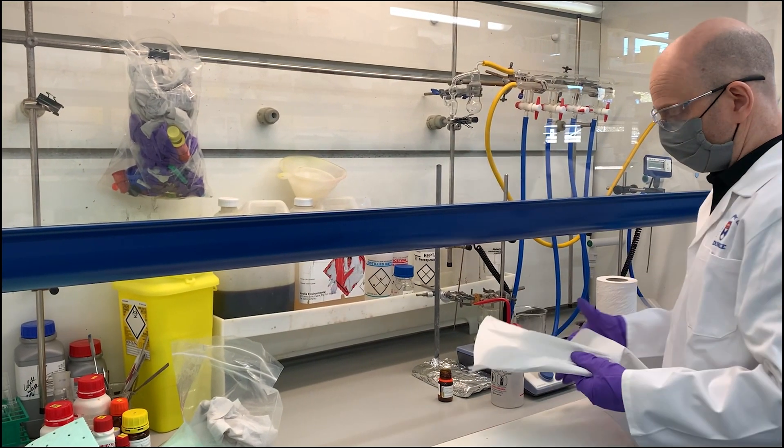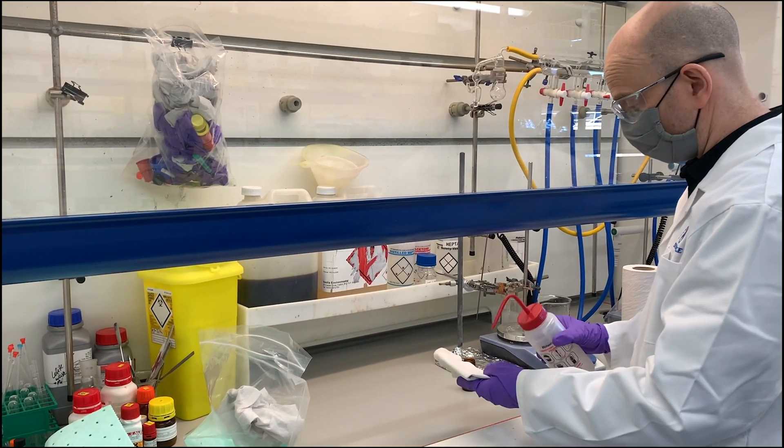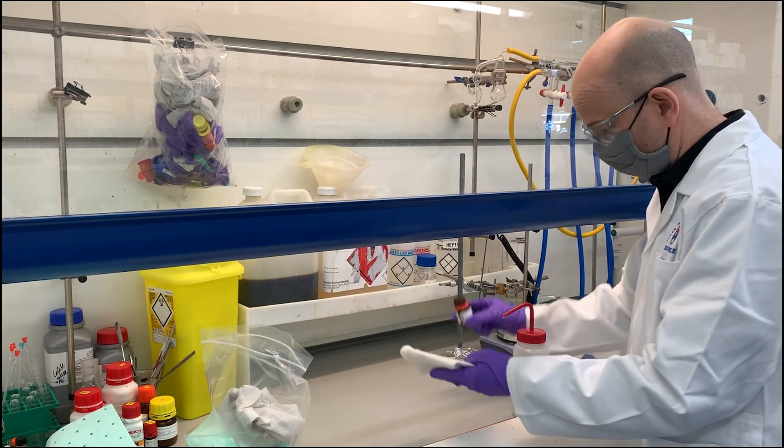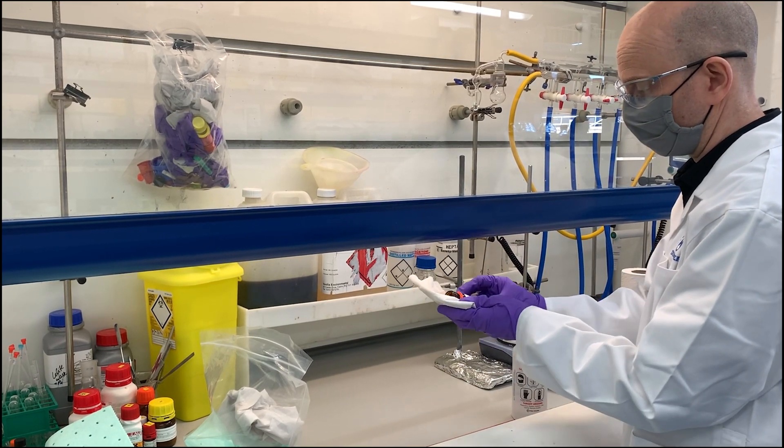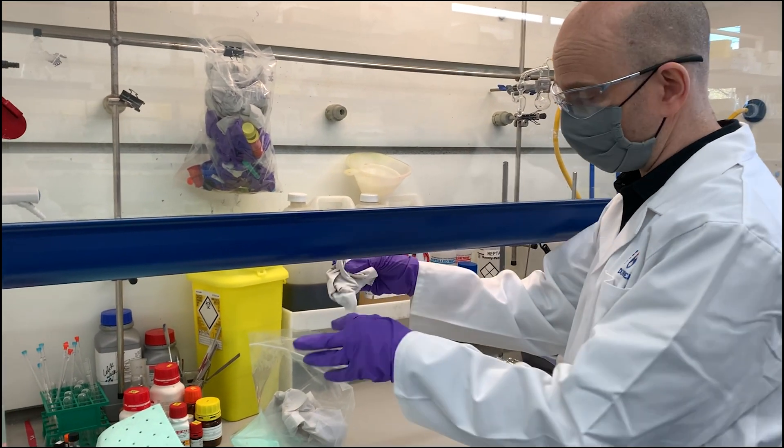Now we can also clean up the reagent bottle that we've used, and then again everything goes into the bag.